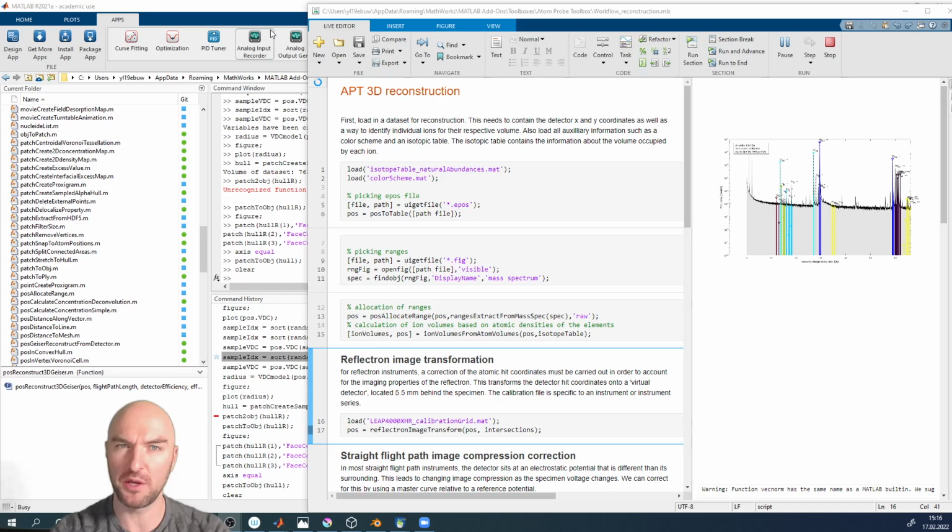And so the question is, how can we make use of those shapes to drive our reconstruction? Unfortunately, in an hour and a half, I don't think we're going to get far enough to go into depth on how to drive a reconstruction using that. There is some stuff in one of my older papers on how to write a solver that can do that. But we're definitely going to get into how to reconstruct objects and how to unreconstruct them, and how to essentially create a feedback loop that you can use to optimize your reconstruction.